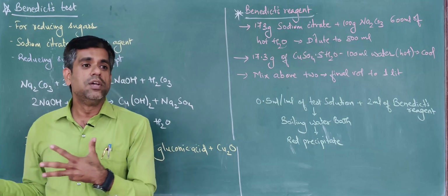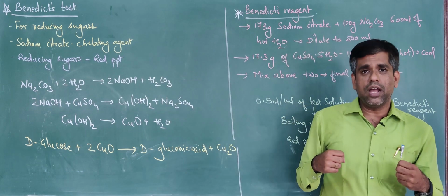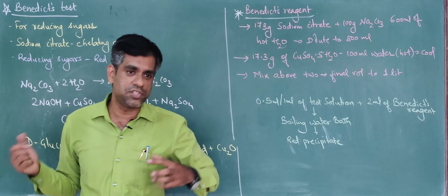Say I also performed the iodine test to detect whether polysaccharides are present or not, and then I am now trying to find out whether the sugars present in the given sample are reducing or non-reducing sugars.